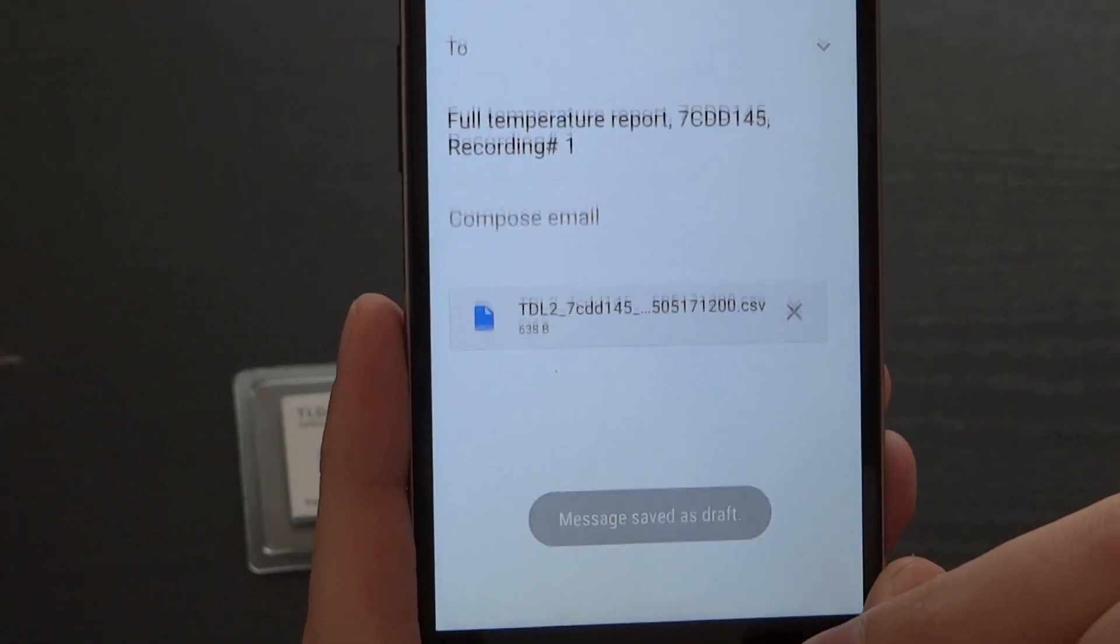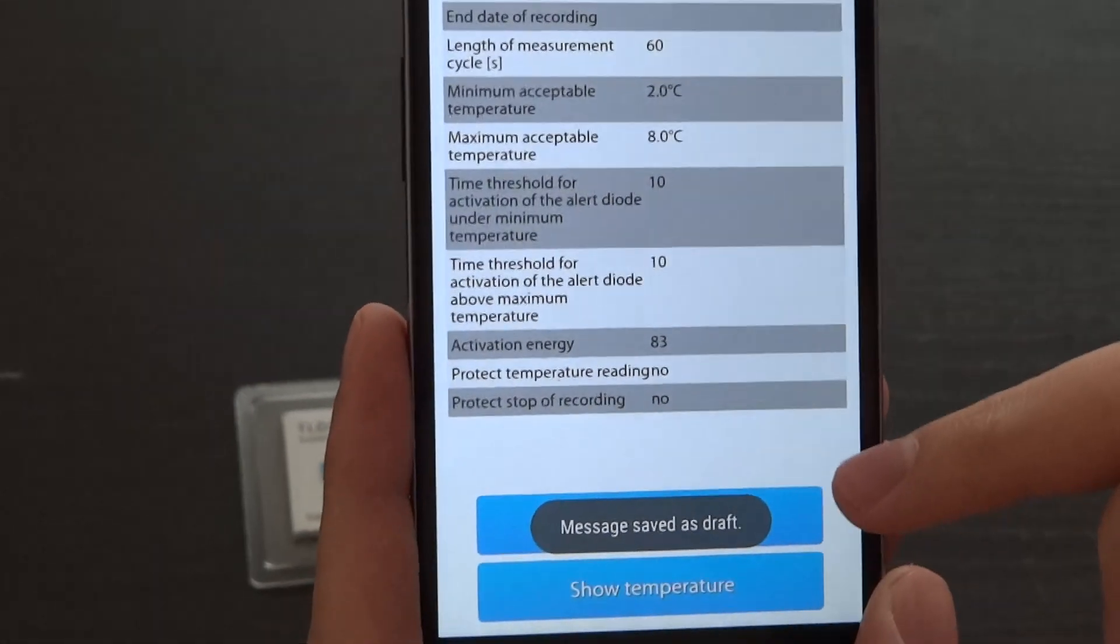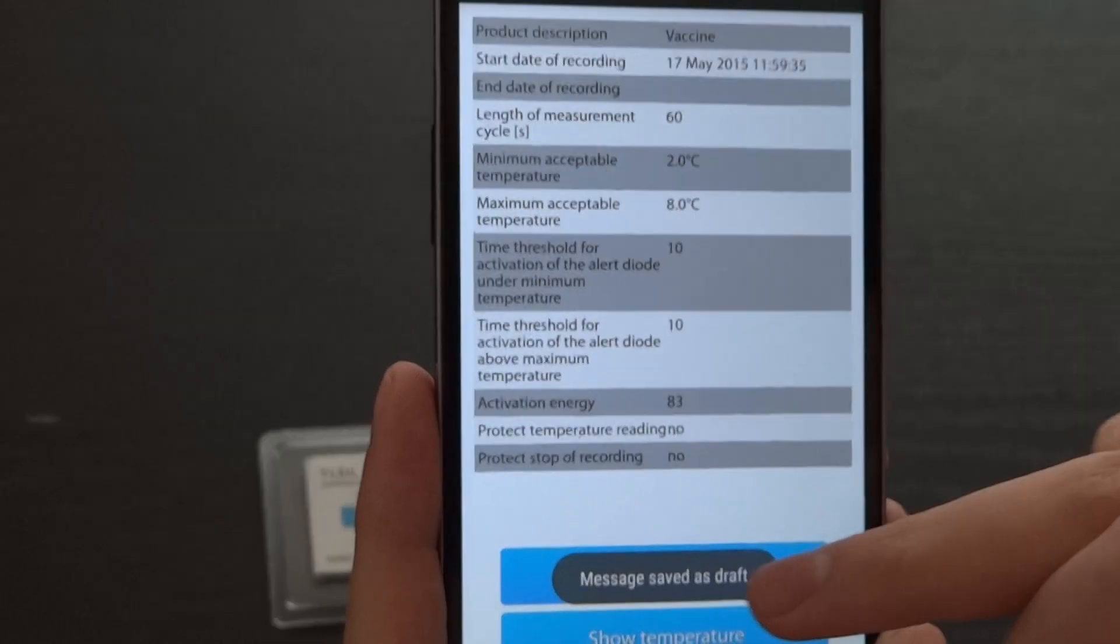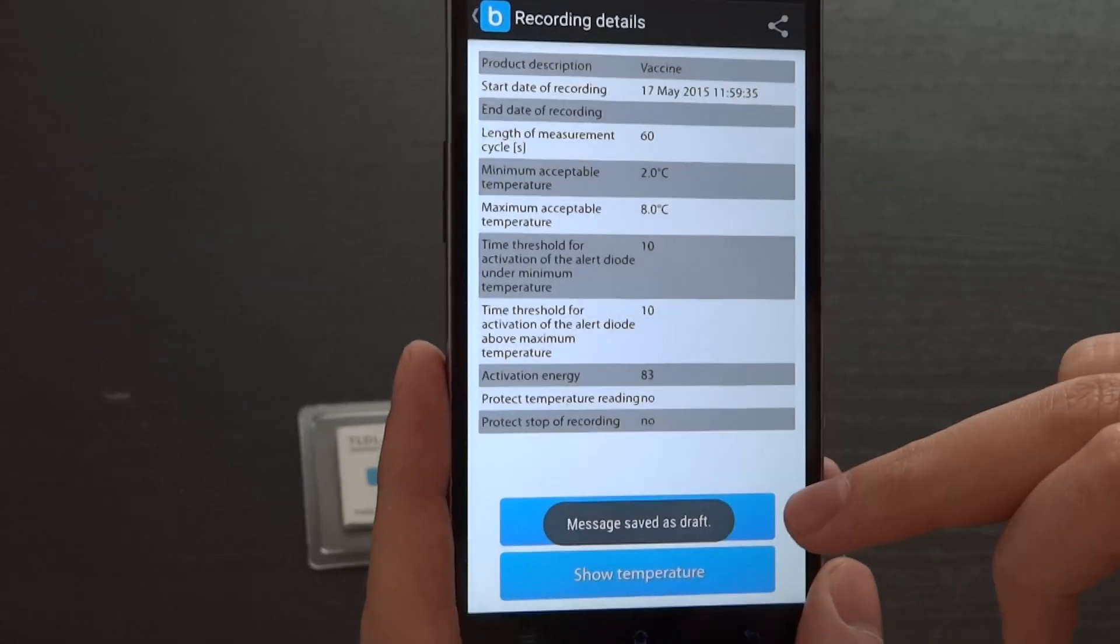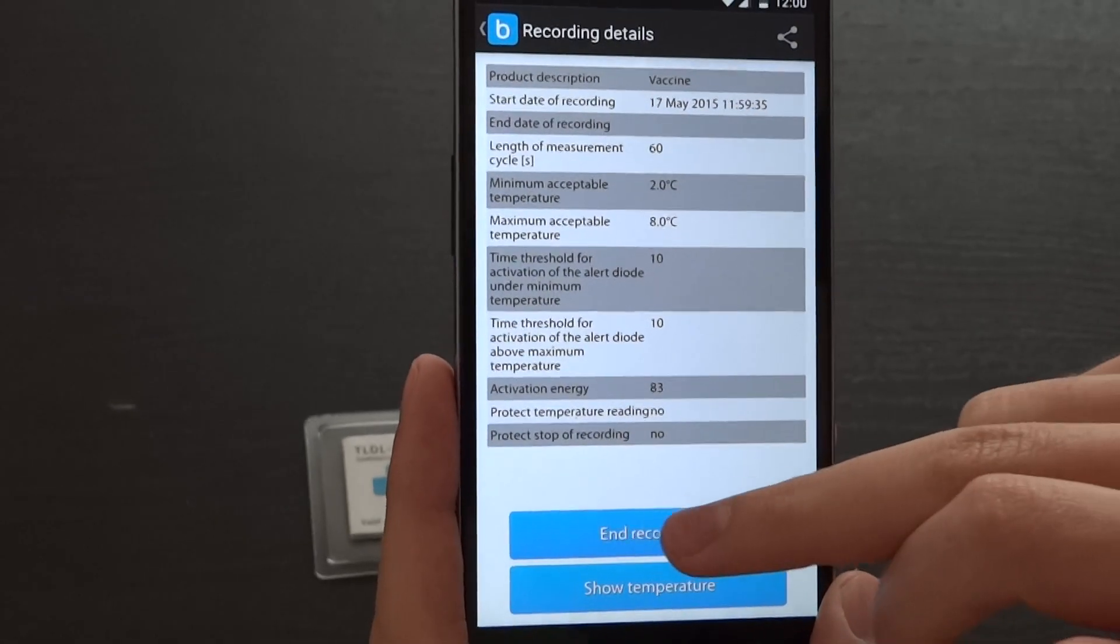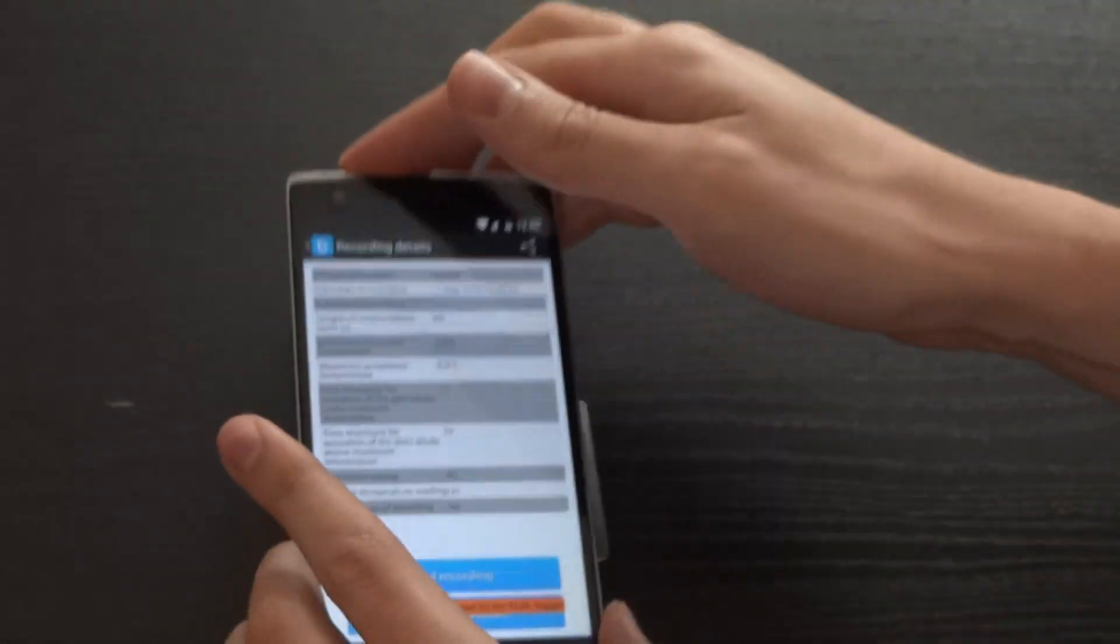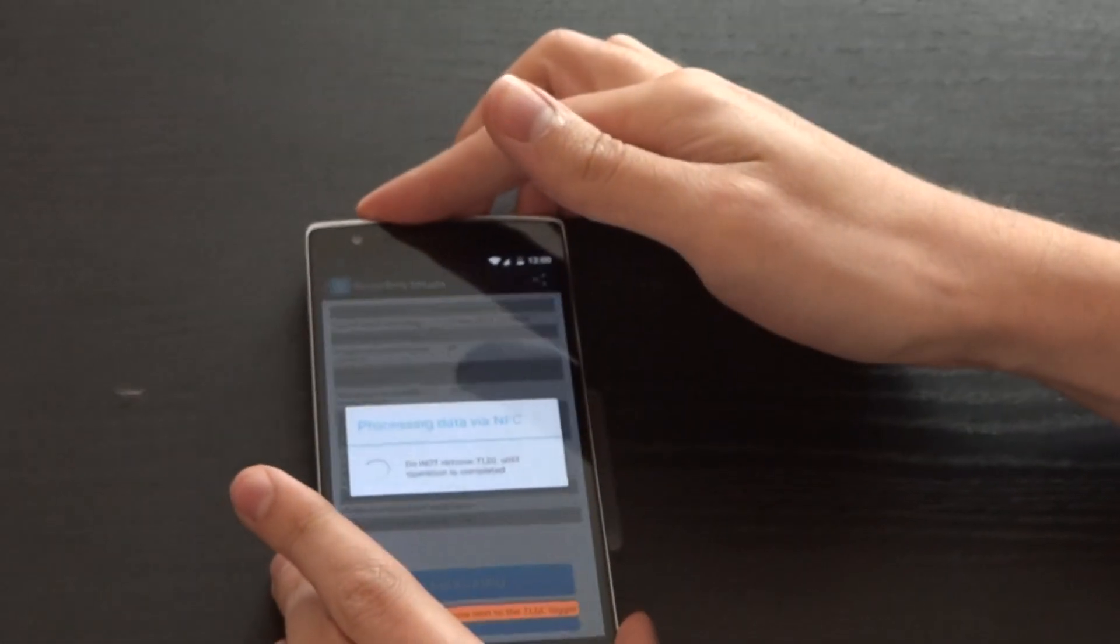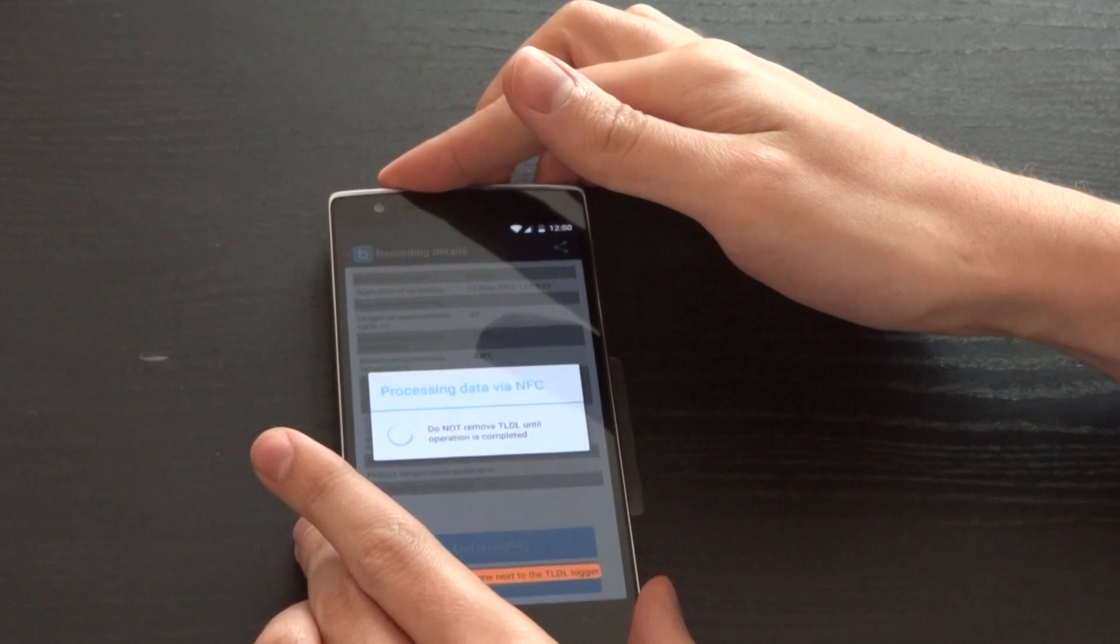To end recording, go back to the previous page and press end recording, and again place your phone next to the logger.